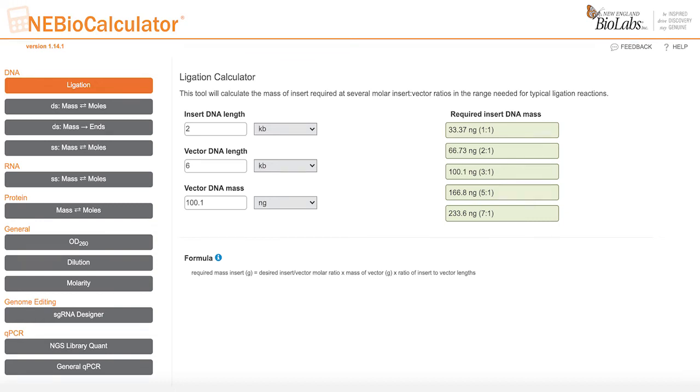When you enter the mass of vector DNA that you want to add to your reaction, you will notice that NEBioCalculator automatically calculates a range of insert masses on the right. We typically recommend starting with a 1 to 3 vector-to-insert molar ratio for an initial ligation, although this depends on the length of your vector and insert fragments.